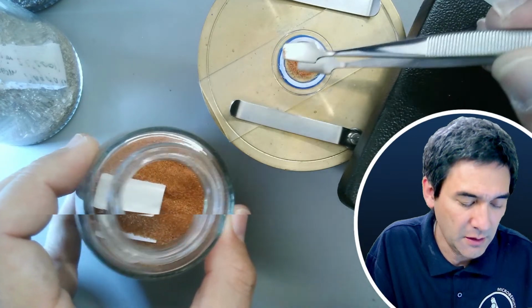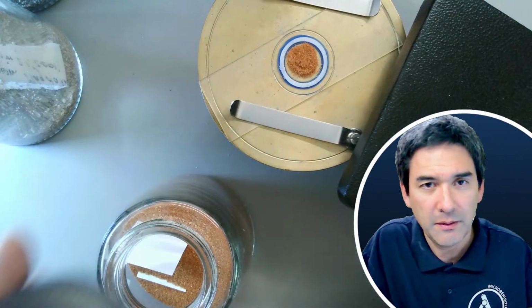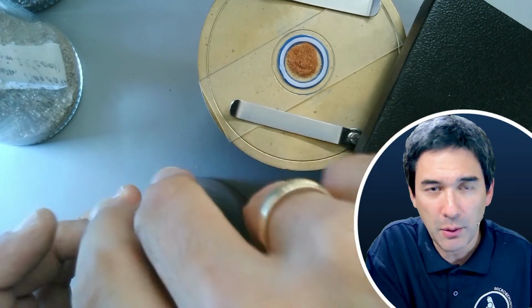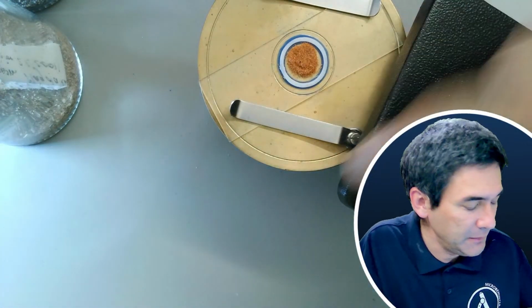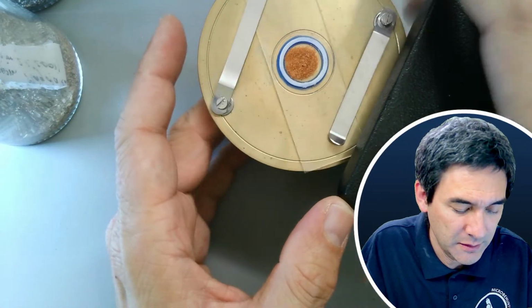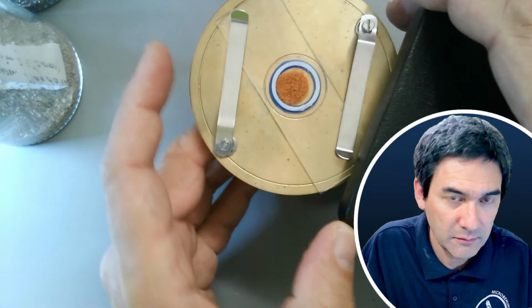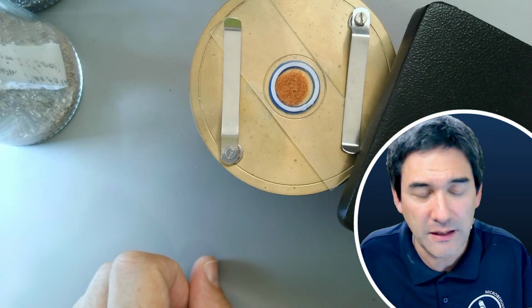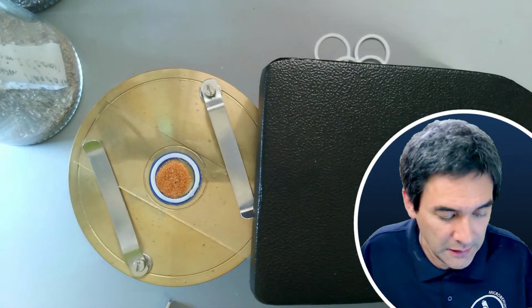Okay, and now the tricky part. The tricky part is now the following. Let's tap it a little bit, maybe to spread the sand. I have to now apply again a little bit of this nail polish or glue or whatever.